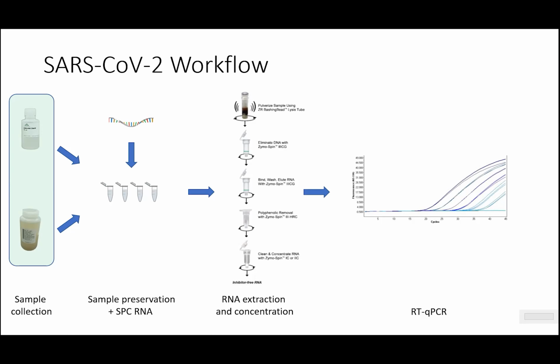Upon arrival at the lab, the sample is placed into an RNA preservative, stored at -80 until the RNA is extracted. The use of a preservative allows us some flexibility when processing, as it prevents RNA degradation from RNases or freeze-thaw effects. So it enables us to retain the signal strength while also reducing variation. Currently, we're using Zymo's RNA DNA Shield. There are other products out there that can perform or at least achieve similar outcomes.